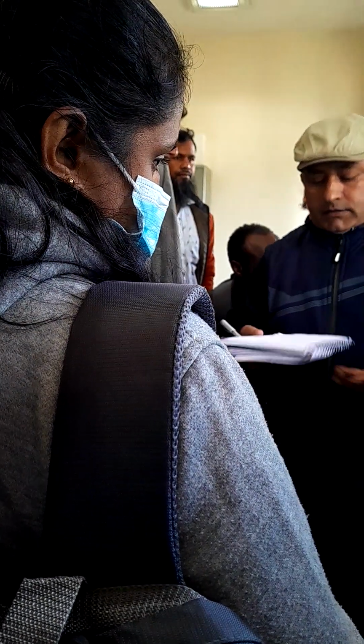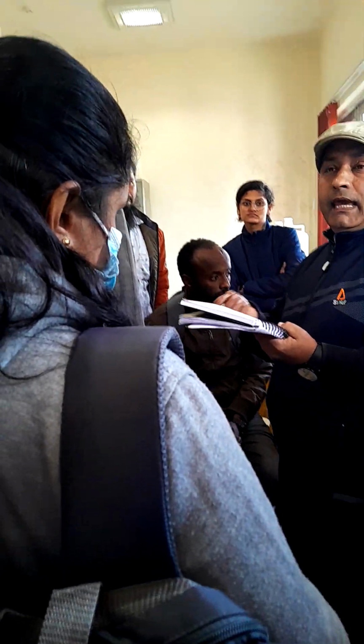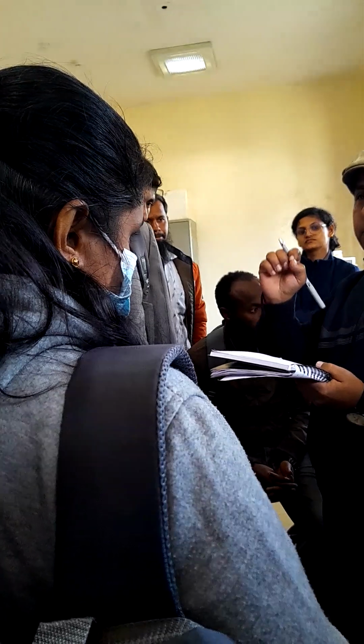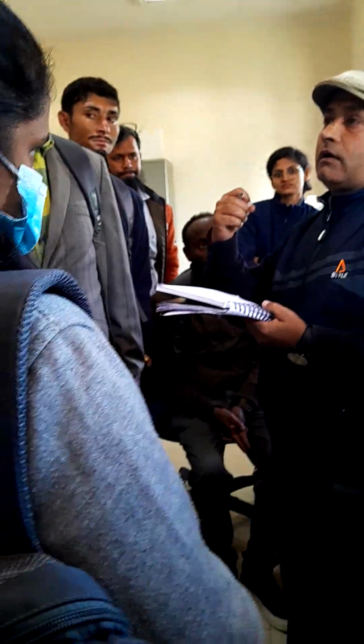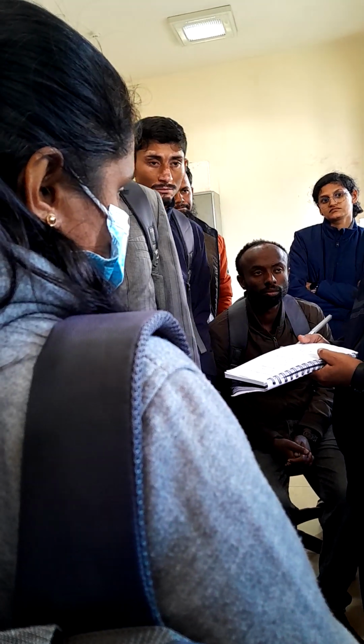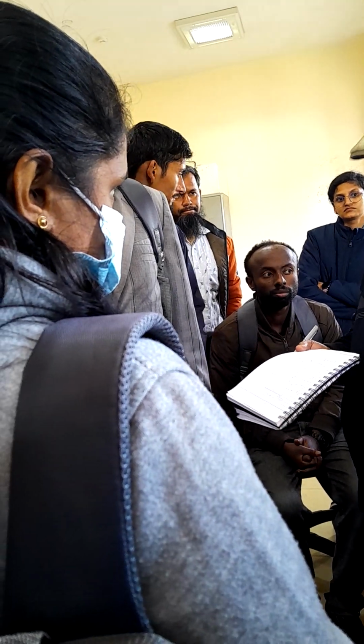Now here, while you are doing the D86, somebody can ask you, can you give one qualitative assessment property of the naphtha? What is the name of the distillation which can assess the quality of the naphtha? So that is your D86.